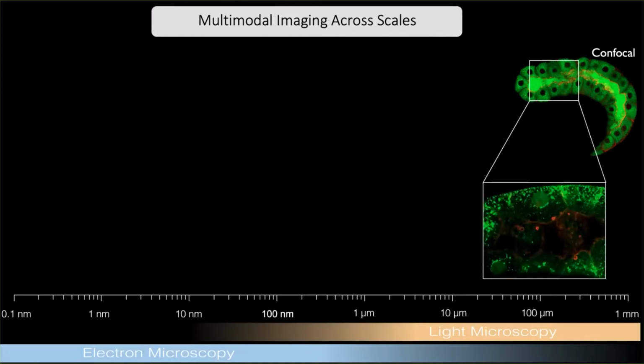And the other challenge is because we are optically slicing, meaning we have to spend time going through this very thick object, we lose on temporal resolution. And, I didn't mention this, endocytosis occurs on a time scale that is between, I would say, 20 seconds to 2 minutes. It's quite a rapid process. We need to be imaging at very high rates if we want to capture this process within a large volume.